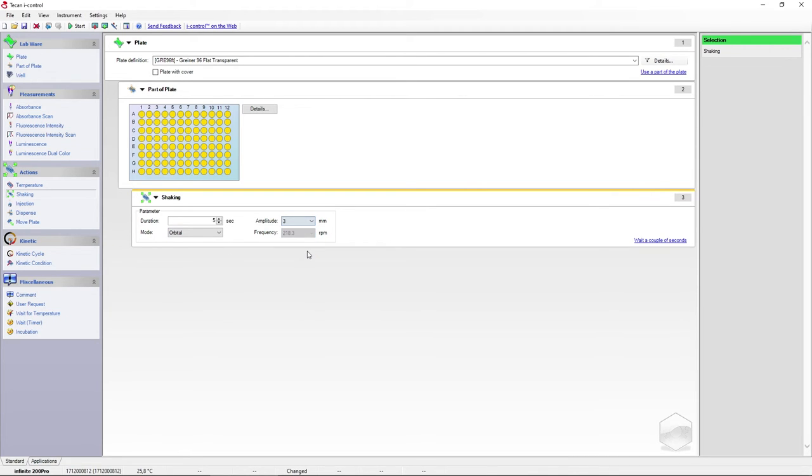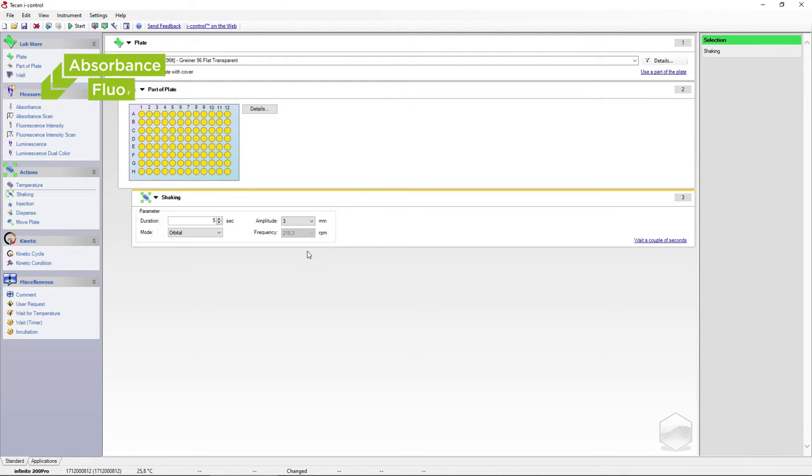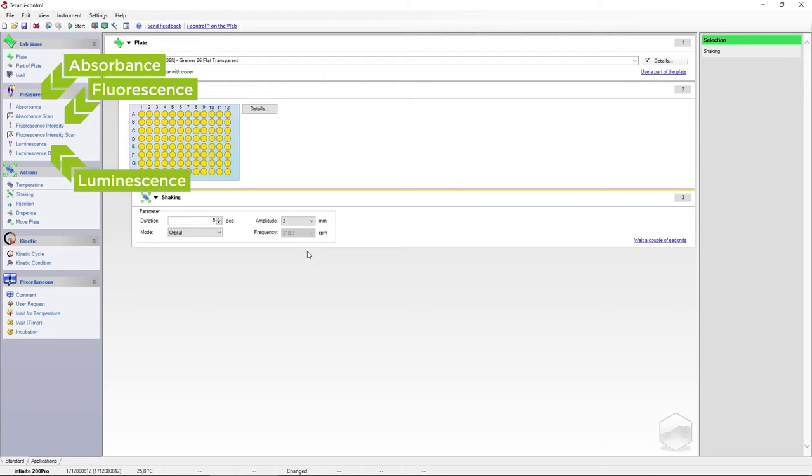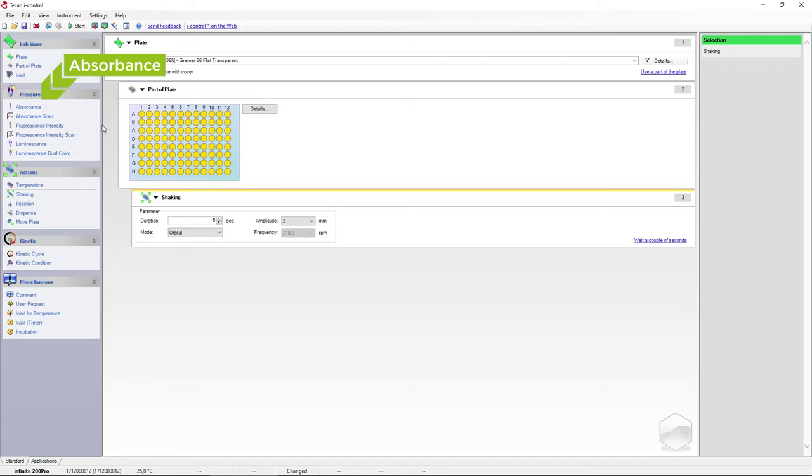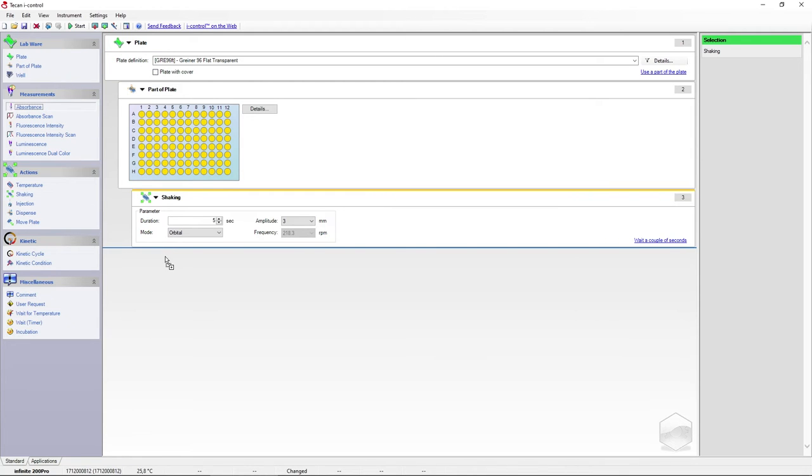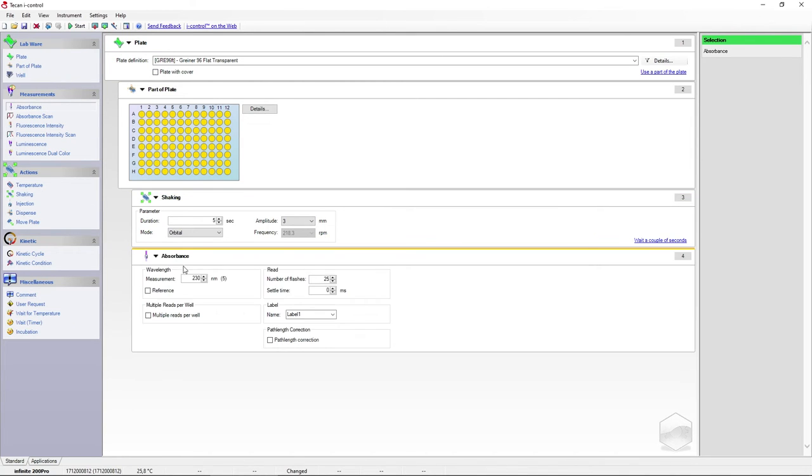Depending on your configuration, the Infinity 200 can have up to three measurement modes. For this demonstration, we want to measure absorbance. We can choose a measurement wavelength and reference wavelength if desired.